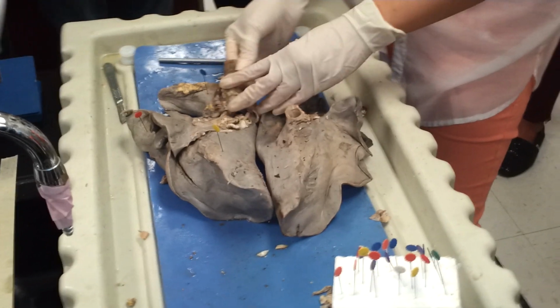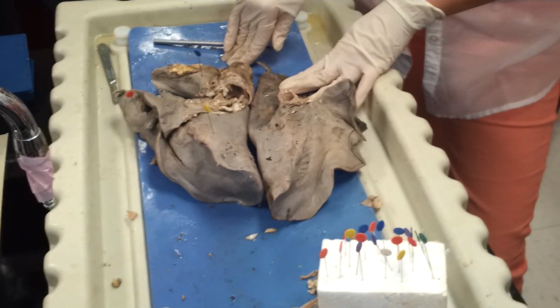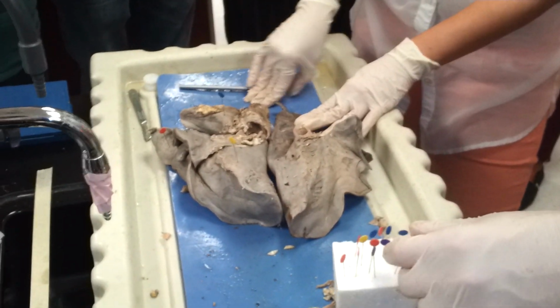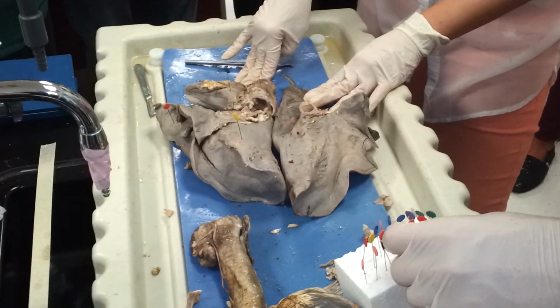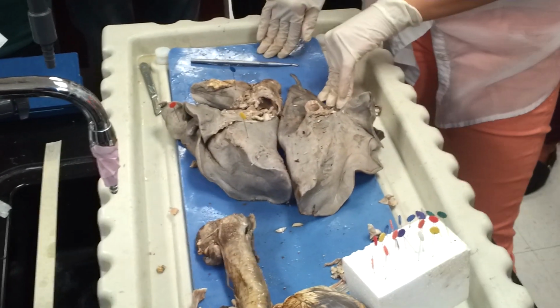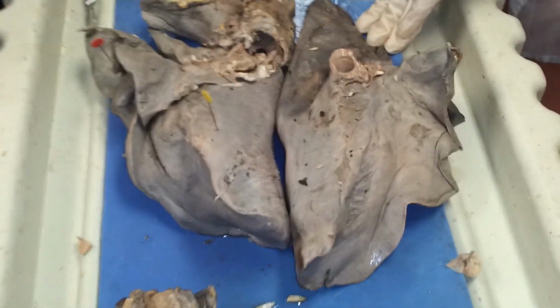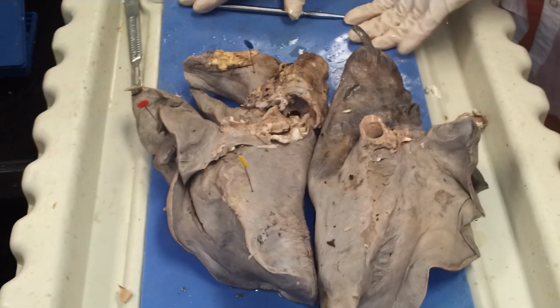Is this so we can see the hilus on there? No, don't worry about identifying the hilus. Just know it by definition. Okay, that's what it says in the study guide here, though. Yeah, okay, it says it, but we should take that. I'm just looking at everything else we're supposed to. Oh, yeah. Stuff with the asterisk. Pretty easy then. Yeah. It's pretty good. As long as you know the orientation, then it's really easy. We can dissect it, but we'll only go over that.